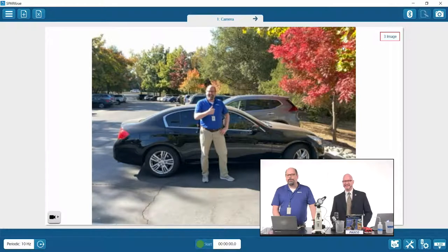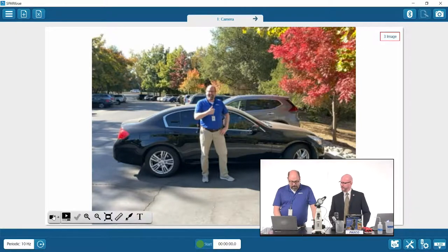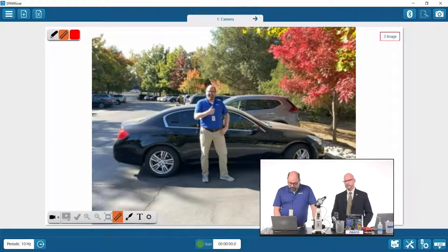But one of the things that you can do with pictures specifically, if you're taking this picture, is that we can use the measuring tool. So I'm going to go ahead and bring the measuring tool up down at the bottom. There are some tools associated, and this button brings those tools open. I'm going to click on the ruler. And I know my thumb, for instance, is 7 centimeters long. So I'm going to stretch that out.